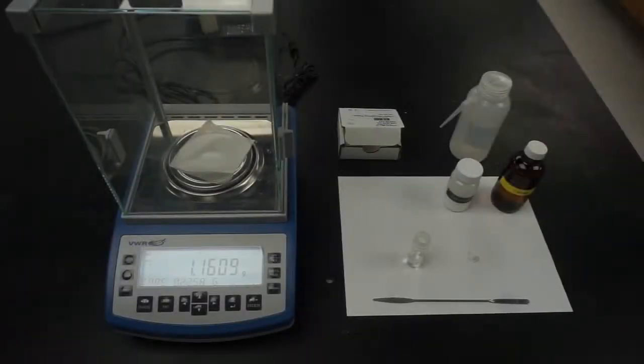First, measure out sodium bromide, about 1.1 grams, and record the exact mass of it in your notebook.